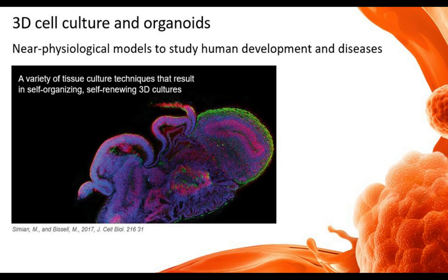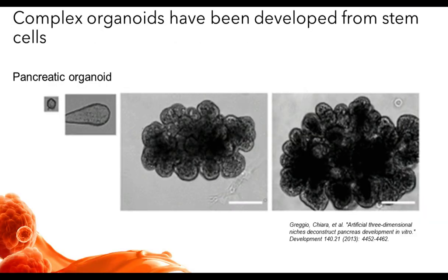Now, some examples of this are shown coming up here. For example, if one takes a pancreatic organoid, these assemblies of pancreatic cells which have differentiated are grown in a Matrigel. With these mouse cells, the goal of this experiment was to study beta cells in the pancreas that can produce insulin, and how you can modulate these cells and optimize them as a means to produce insulin, and therefore study some of the fundamental disease processes involved in diabetes.